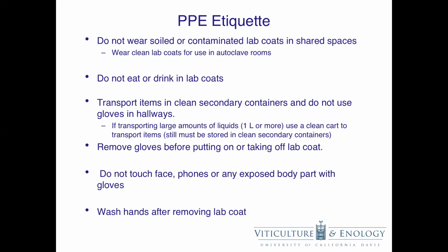I would like to discuss some PPE etiquette. Do not wear soiled or contaminated lab coats in shared spaces. This is true for both chemical and biological contamination. Wear clean lab coats for use in autoclave rooms. Do not eat or drink in your lab coats. Unfortunately, I have seen too many people in these buildings do this. I know not many of you will be working with hazardous material, but this is still something that should be abided by for the same reason that you should not eat or drink in your lab.